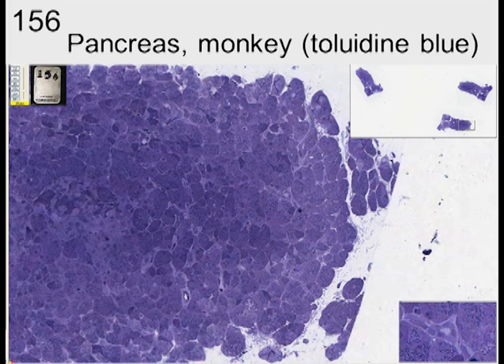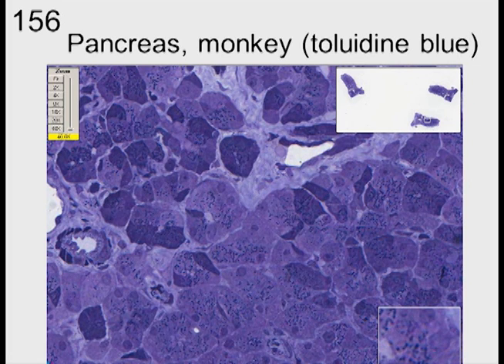Here we see the pancreas of a monkey with toluidine blue. If you go to a higher magnification, you can see that the secretory granules near the apex, near the lumen, are very dark and dense. With toluidine blue, you look for the size and the density of things — dense things are very dark. In contrast, you see the nuclei are not that dark, and you see the connective tissue around there. And if you've got a keen eye, you might be able to see some ducts.